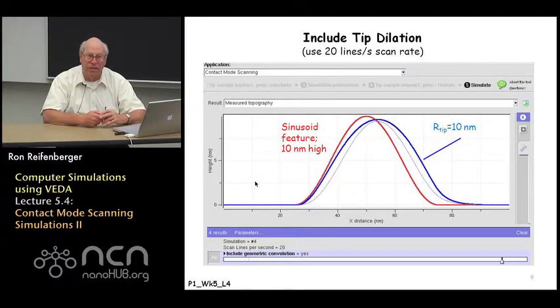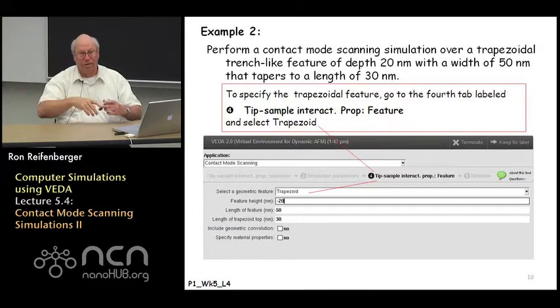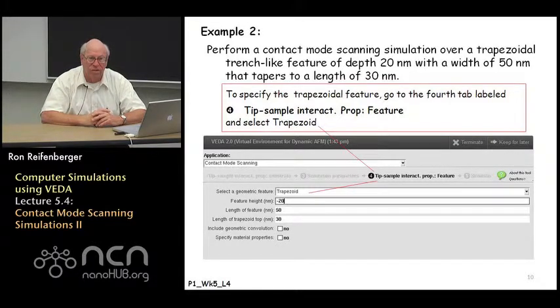So this is just an example that you can work through and get some intuition about what new features are introduced when the tip scans over a feature in the substrate which is continuously varying. There are no sharp edges in it. Just to emphasize that, it's possibly not obvious if you sit down and just think about this ahead of time. The simulation helps to bring out these different features.